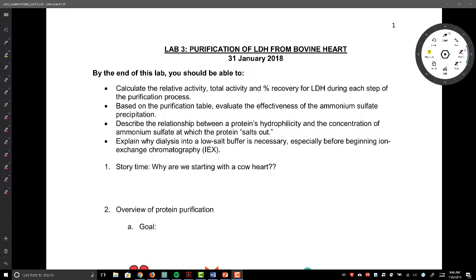And that's because back in the day, before we knew how to manipulate microorganisms like E. coli to express proteins for us, you had to find the tissue of an animal that overexpressed one particular protein and then extract the protein from that animal tissue. And one particular example of this is in biochemistry, you have or you will be learning about bovine pancreas RNase.